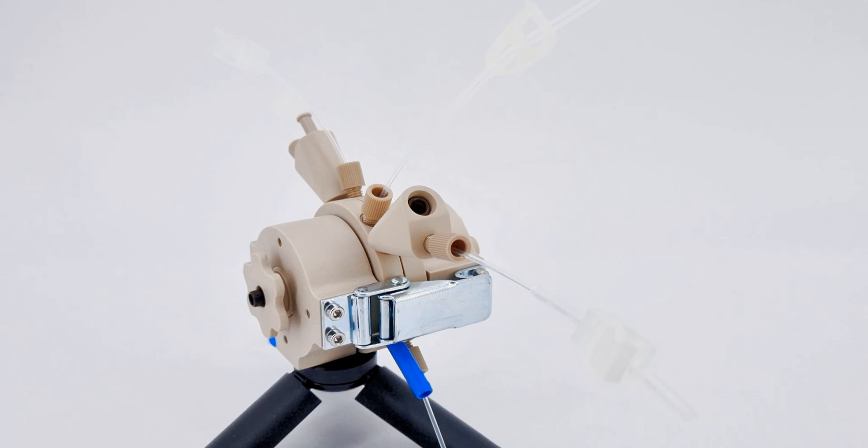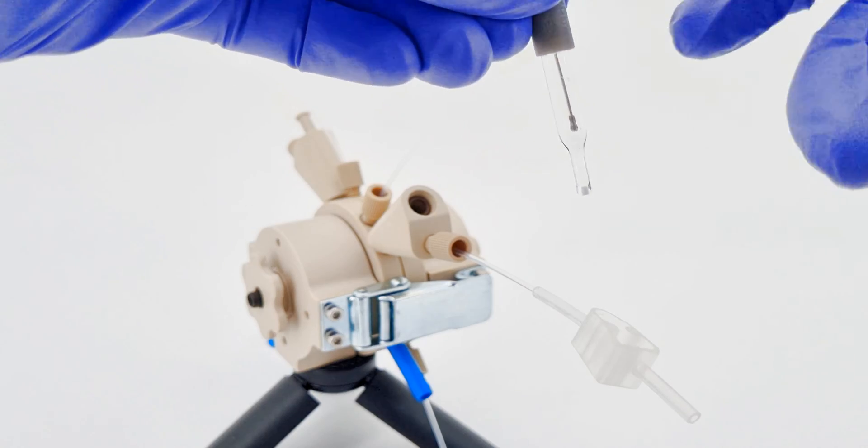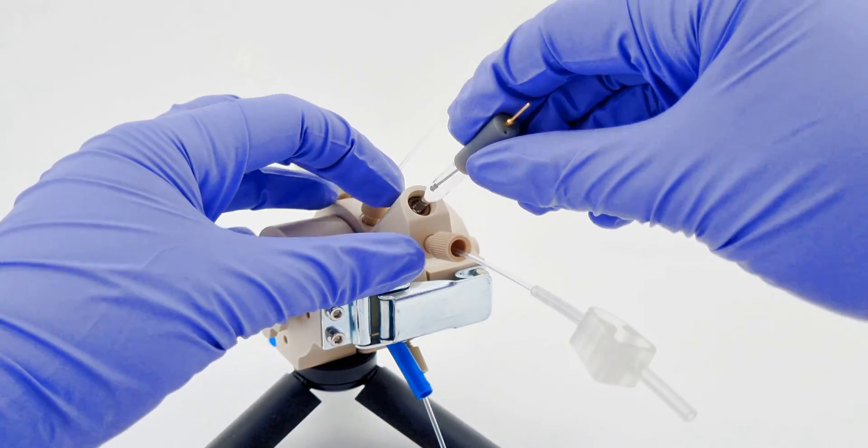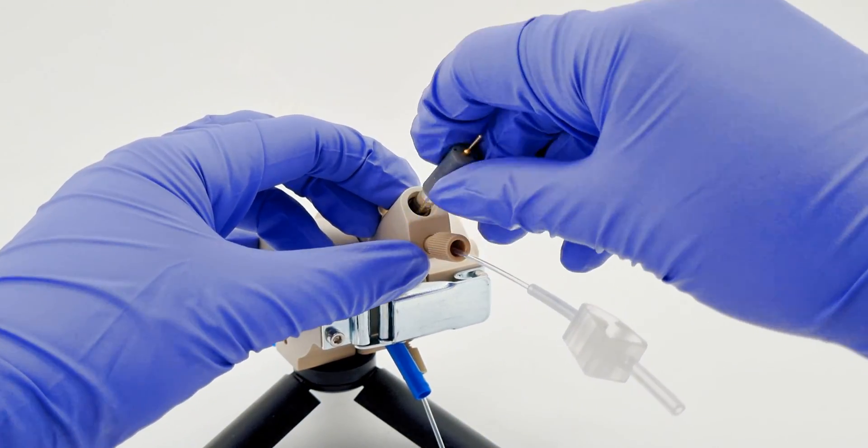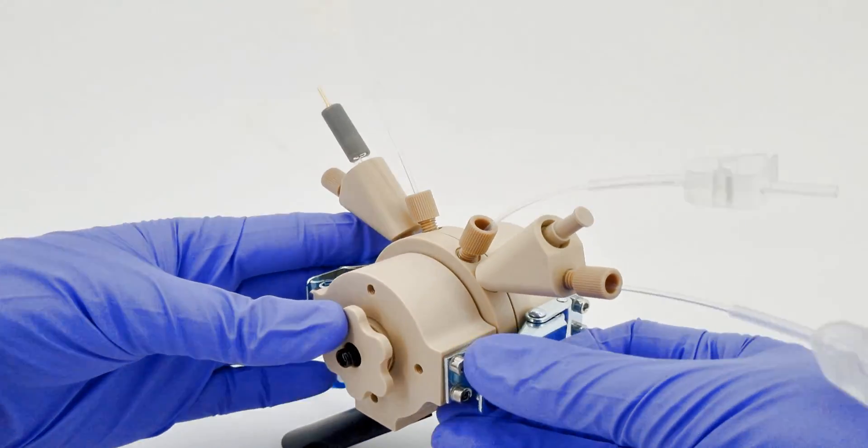Next, take the cap off the reference electrode and give it a gentle tap. This will get rid of any sneaky bubbles hiding by the frit. Lastly for this step, with a bit of a twist, push the reference electrode into its holder.